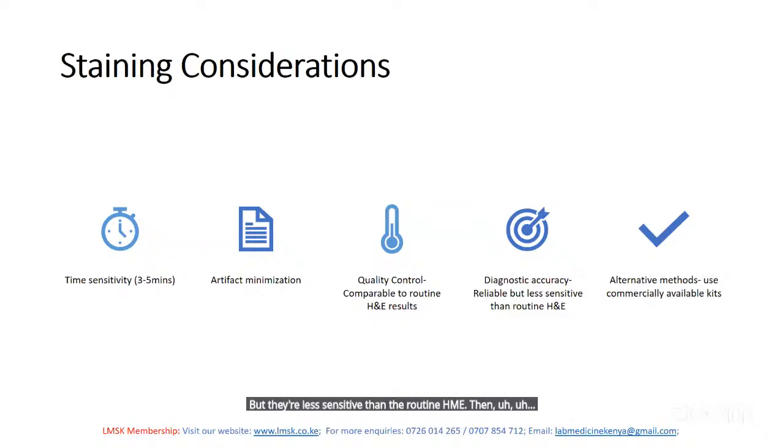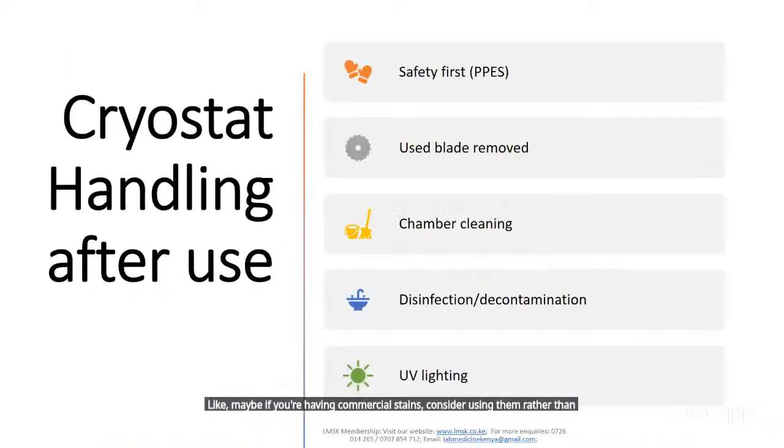Then consider alternative methods that are available commercially. Like maybe if you're having commercial stains, consider using them rather than preparing your own stains.